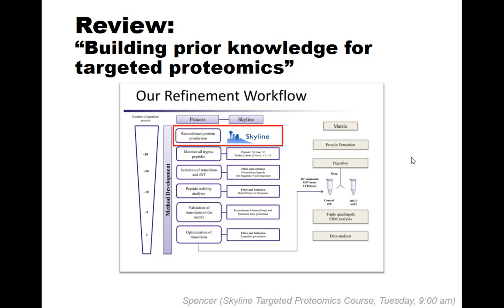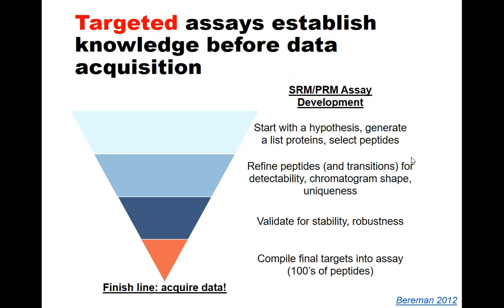A couple days ago on Tuesday, you guys woke up bright and early for Sandy's talk on how to build prior knowledge for targeted proteomics. And if this feels a little deja vu, it's because this is going to follow a similar vein as that talk. And one of the things she tried to emphasize was that with targeted assays, you're establishing knowledge before you go off and acquire your data.